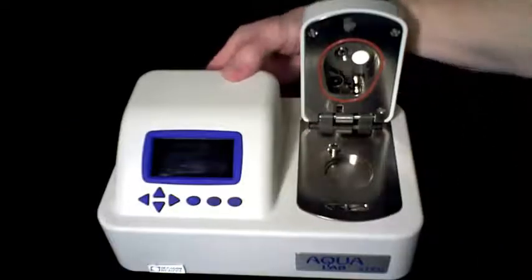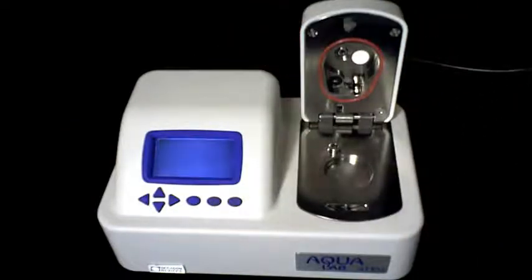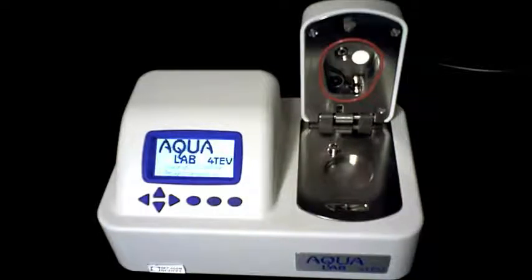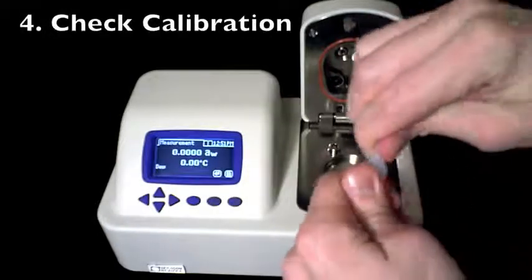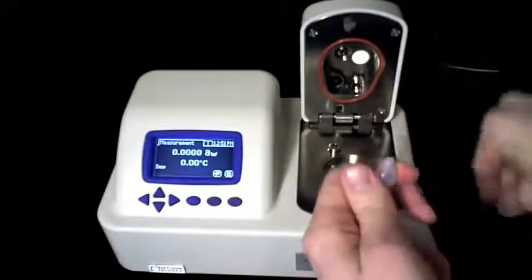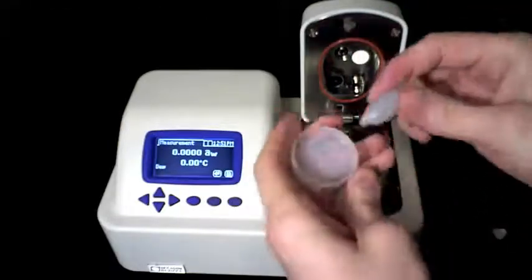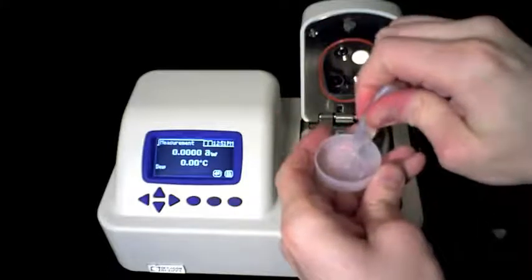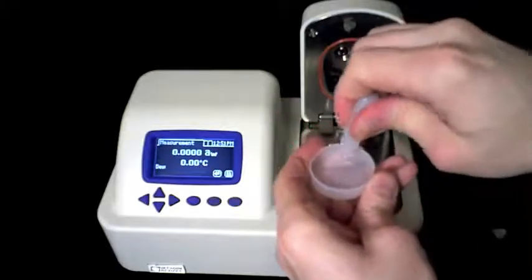After the cleaning process, it's important to verify that your instrument is operating properly. First, power your Aqualab back on. Then, take one vial of verification standards and put it in a sample cup. Place the sample cup inside the instrument and close the lid.